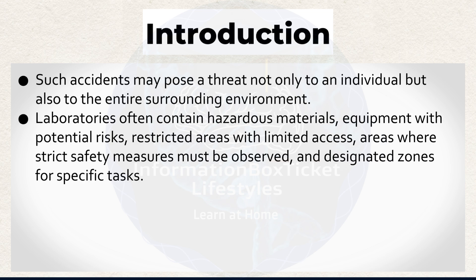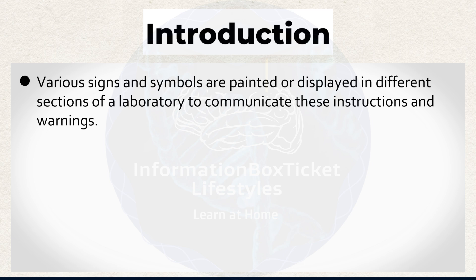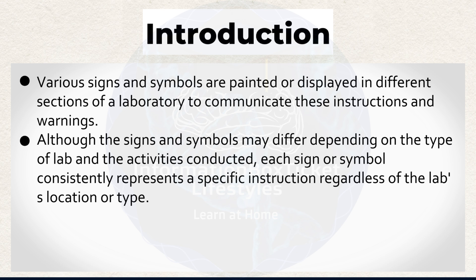Laboratories often contain hazardous materials, equipment with potential risks, restricted areas with limited access, areas where strict safety measures must be observed, and designated zones for specific tasks. These areas must be clearly indicated to ensure that everyone understands the situation, knows what actions are permitted, and works accordingly to maintain laboratory safety. Various signs and symbols are painted or displayed in different sections of a laboratory to communicate these instructions and warnings. Although the signs and symbols may differ depending on the type of lab and the activities conducted, each sign or symbol consistently represents a specific instruction regardless of the lab's location or type.